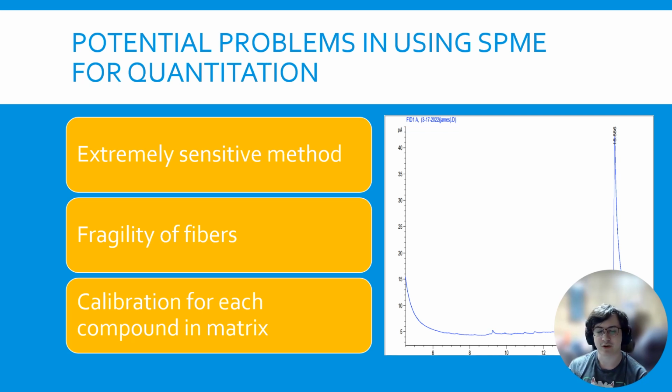But if you forget to retract them and then you try to pull them out, it can damage the fiber, and then it can end up, as it happened with me, the fiber spinning in your solution, and then you're like, well, I guess that's the end of that fiber's life.